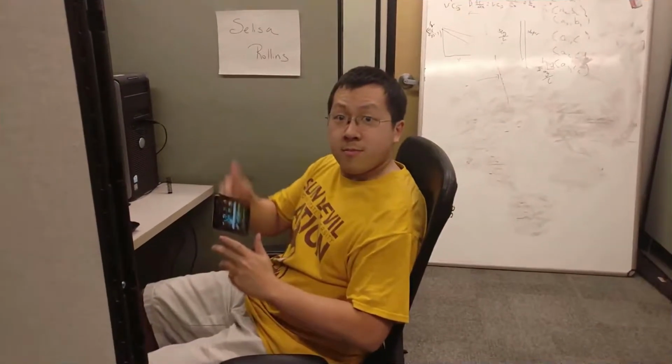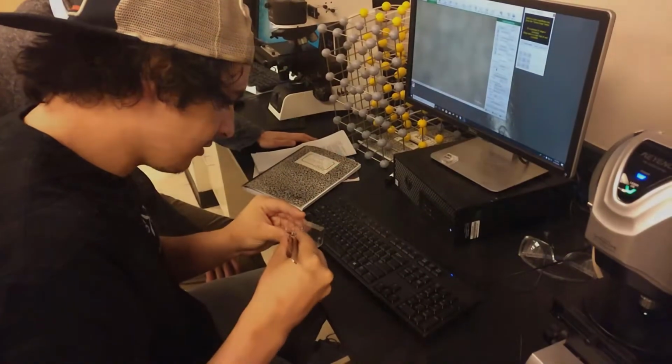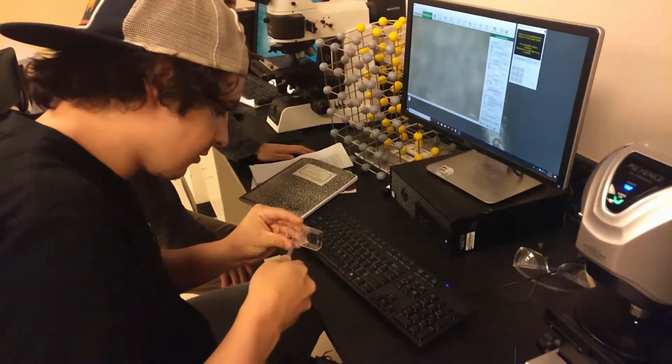Yeah, boy! This is the Keyence VKX150 laser confocal microscope. First, turn on the laser confocal microscope and wait 5 minutes for the laser to stabilize. Next, we use tweezers to place the sample onto the stage.